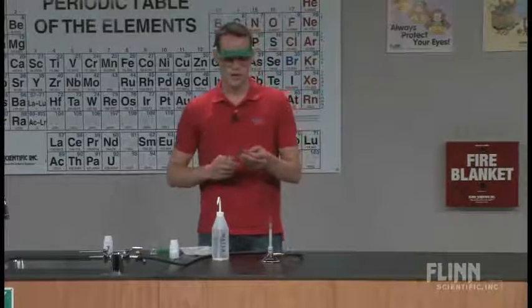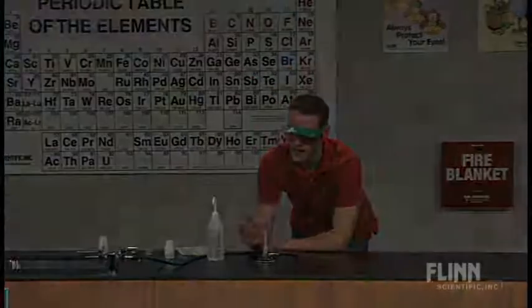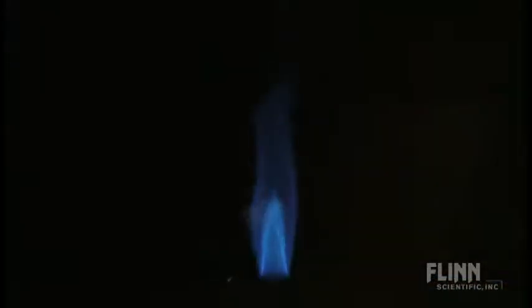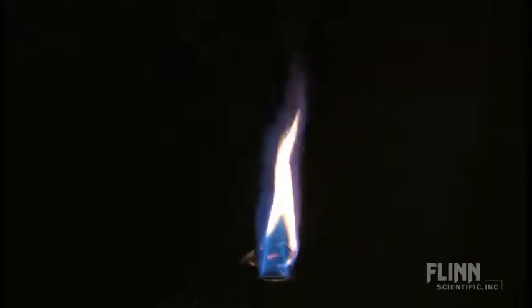And they do this with and without the cobalt glass. But if we turn the lights off and we hold the banana chip in the side of the flame, the question we're asking is, is there sodium in bananas? And if you're looking for sodium, we're looking for what color flame? So we're looking for that mixture. You'll see a mixture of yellow, or the yellow gold, and a mixture of the lavender flame as well.